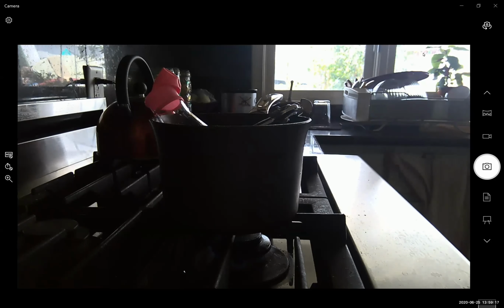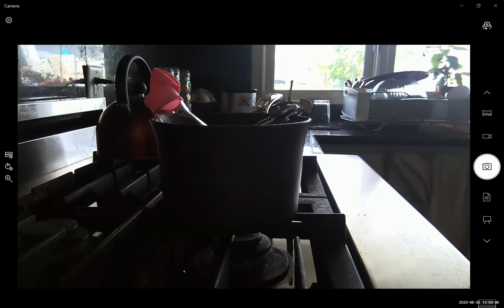So we have a nice low heat. We're warming our water and we're observing what happens to our balloon over time. So let's wait about 10 minutes. This time, this is a qualitative experiment. So we're just getting a sense of the relative change in volume as we change the temperature of our gas inside our Erlenmeyer flask. So we'll watch this sample for about 10 minutes and we'll resume this recording after 10 minutes.